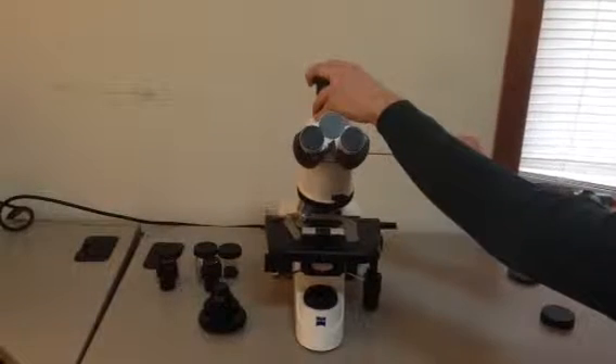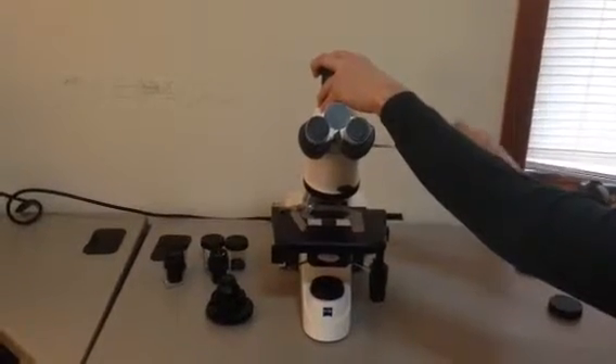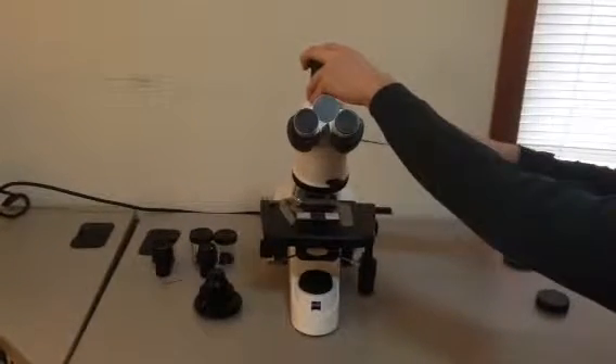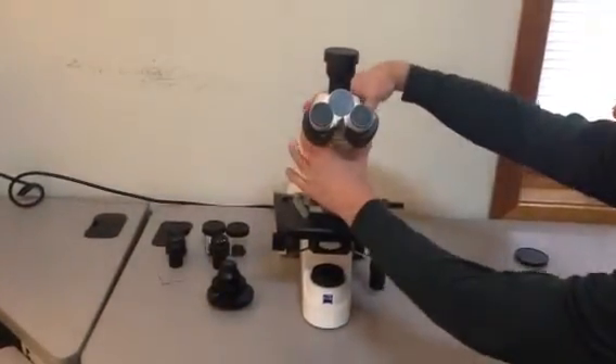Tighten it down with the Allen wrench — nice and firm, but not over tight. You just want to make sure that it's on straight.